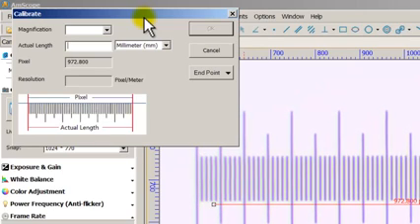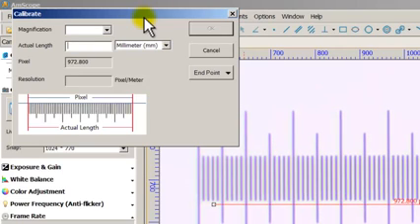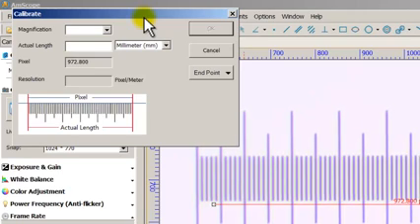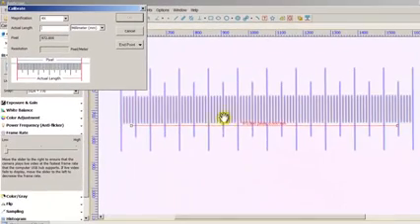But basically, there's 4 objectives on it. These are the rotating objectives on the bottom, just in case you weren't sure. So one is 4, 10, 40, and 100. And for calibrating your microscope, you have to make sure that you calibrate for each individual objective. So everything I'm going through right now, you're going to have to calibrate for each of the objectives on the microscope. Okay? So right now I'm on the 4. So for magnification on the drop down here, I'm going to choose 4. Alright? And for actual length, this scale is in millimeters here.